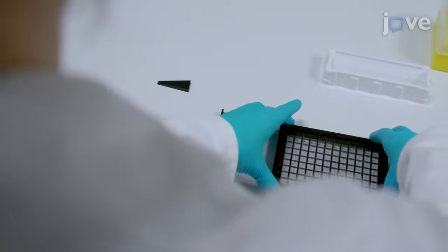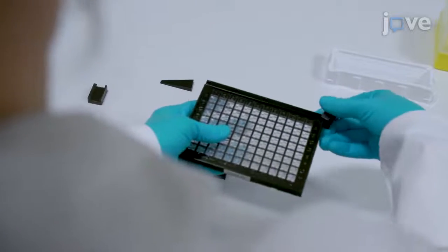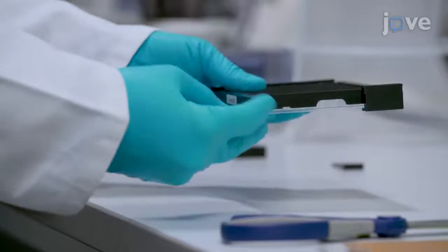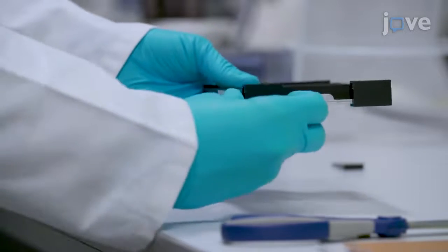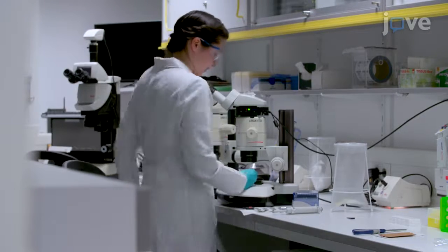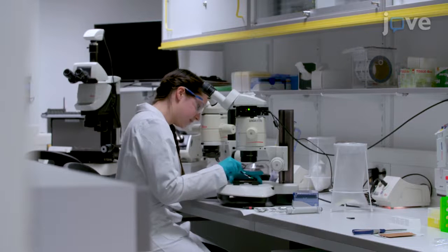Place the easy access frame on top of the screening plate and secure it with the included clamps by sliding them onto the left and right side of the device. Place the screening plate and easy access frame under the microscope and slide open the first well by moving the respective acrylic glass tile of the frame.